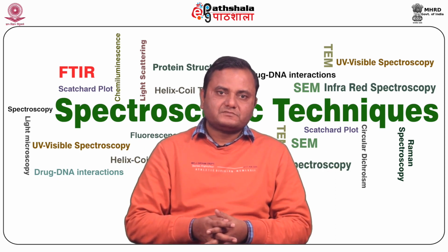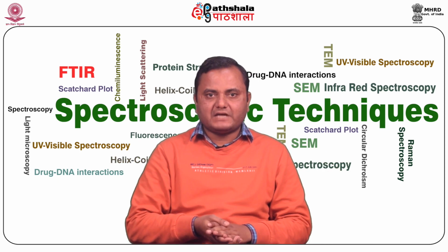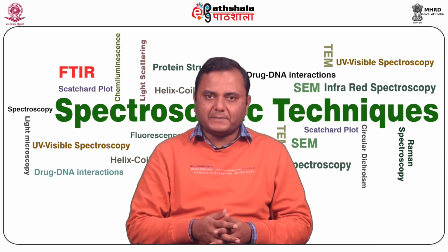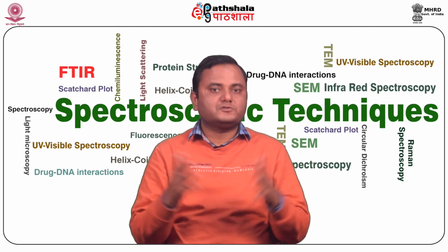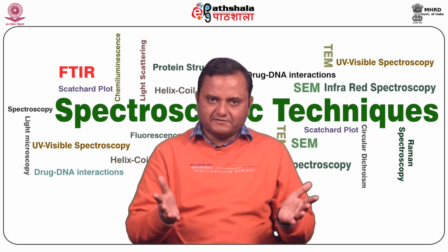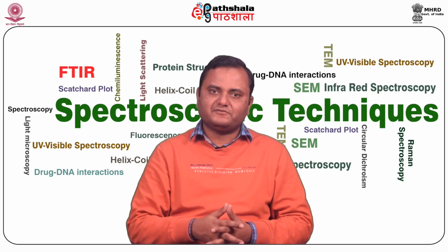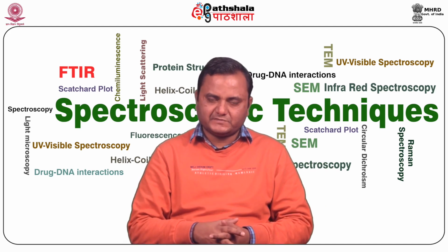fluorescence. Then the introduction of paramagnetic ions gives rise to phosphorescence but not fluorescence in the metal complexes. And at last, a change in the system pH may also affect the fluorescence, because by changing the charge state of the compound, the delocalization of electrons is affected, and thus the fluorescence intensity is greatly affected by a change in pH of the system.